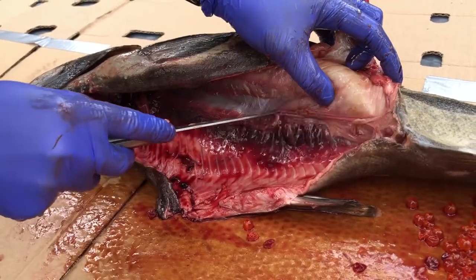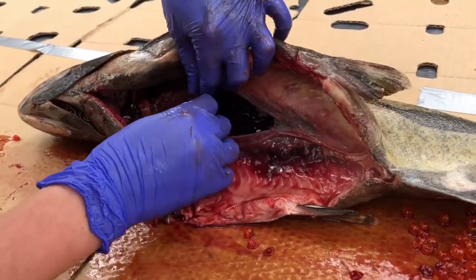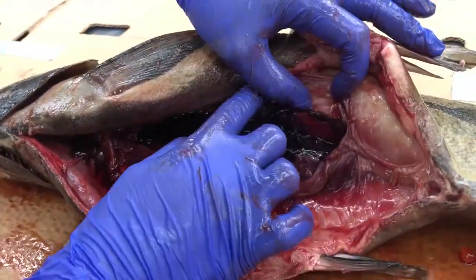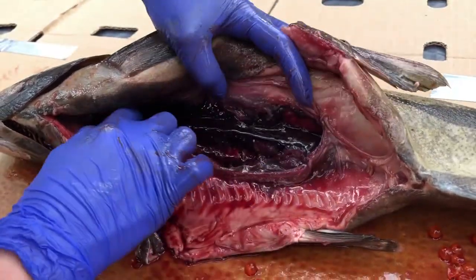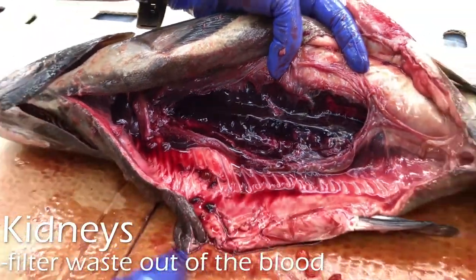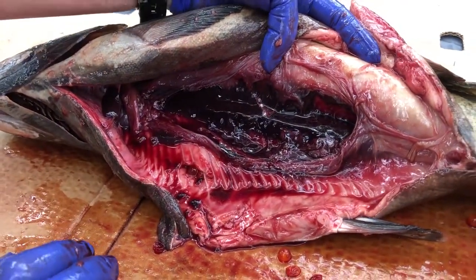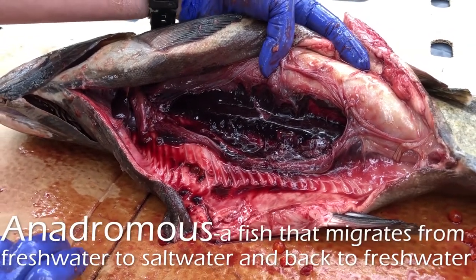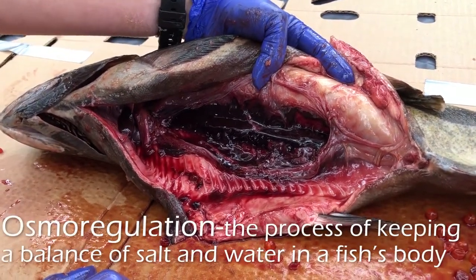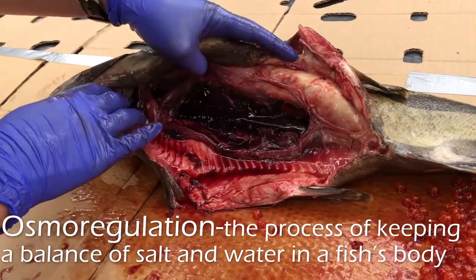I'm going to slit this open so that we can see what's behind it. Behind the swim bladder, right up against the backbone, we have this super dark red organ — these are the kidneys. The kidneys are really important in fish because they help filter liquid waste out of the blood, which is then excreted as urine out through the vent. In salmon, which are anadromous — meaning they go from fresh water to salt water and then back to fresh water — the kidneys are extra important because they aid in osmoregulation, which helps them adapt from fresh water to salt water and get all that extra salt out so they can survive.